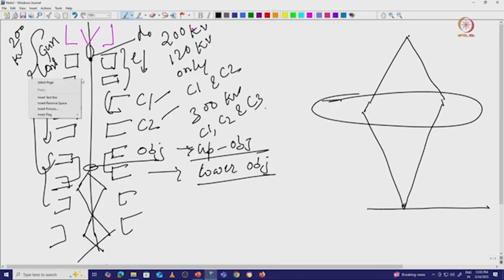Then the electron beams are changing their path length. They are converging, diverging and going on different paths. Finally they converge at one particular point. So you can see if we don't have any sample, it will constantly converge and diverge, and it merges in one particular plane here, where we'll get a dot again.